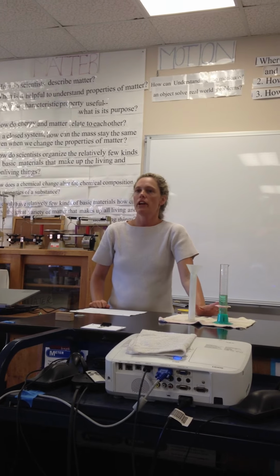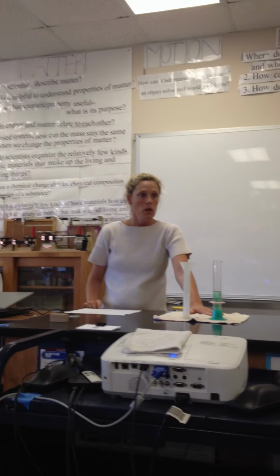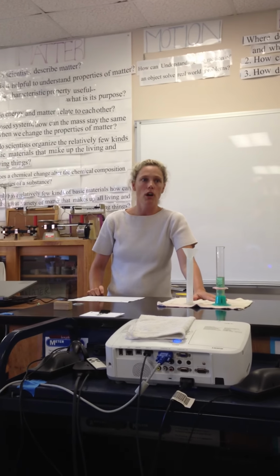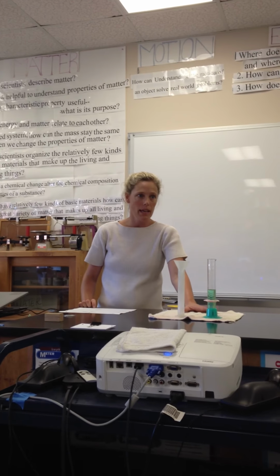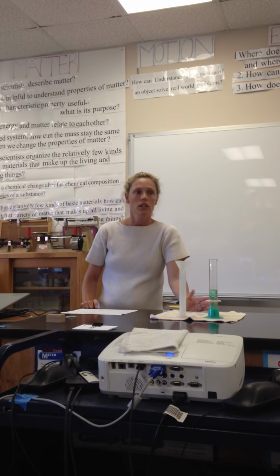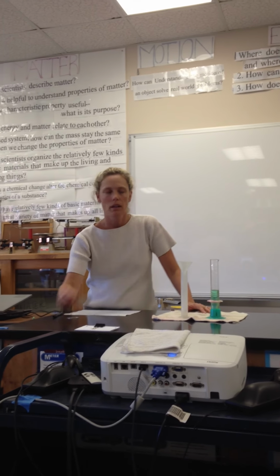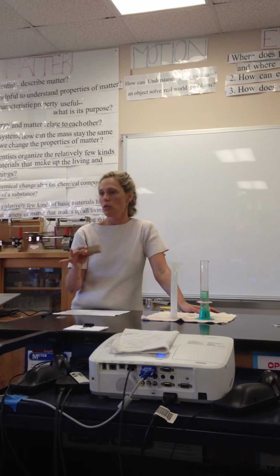In this activity, our goal for today, as I said, is just to practice with the graduated cylinder. Tomorrow, there will be a much stronger focus on precision and significant figures. But today it is to practice the water displacement method and just a refresher on measuring the volume for regular objects. So everybody has rulers in the setup.